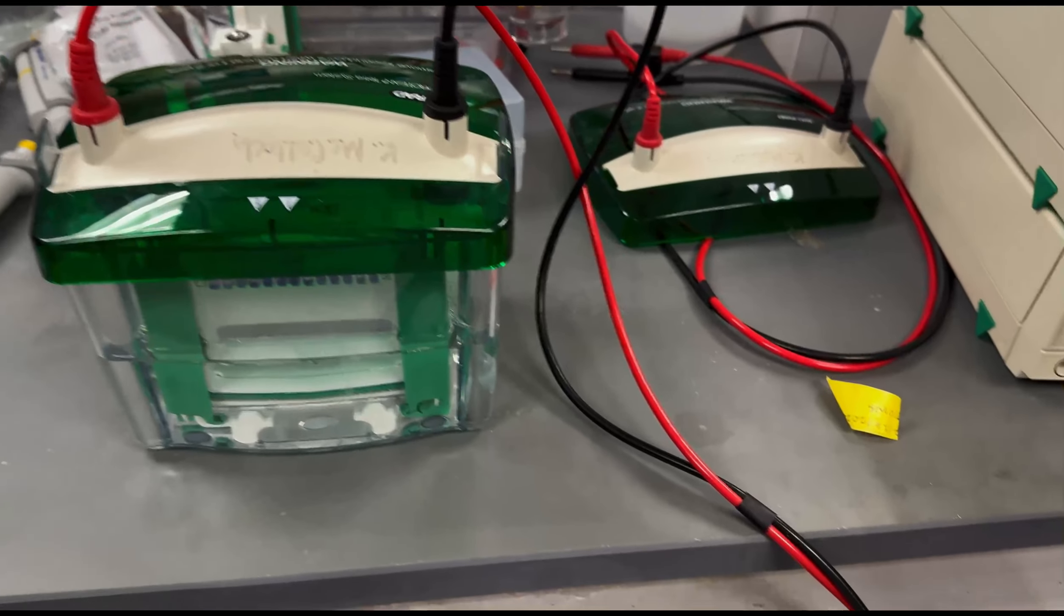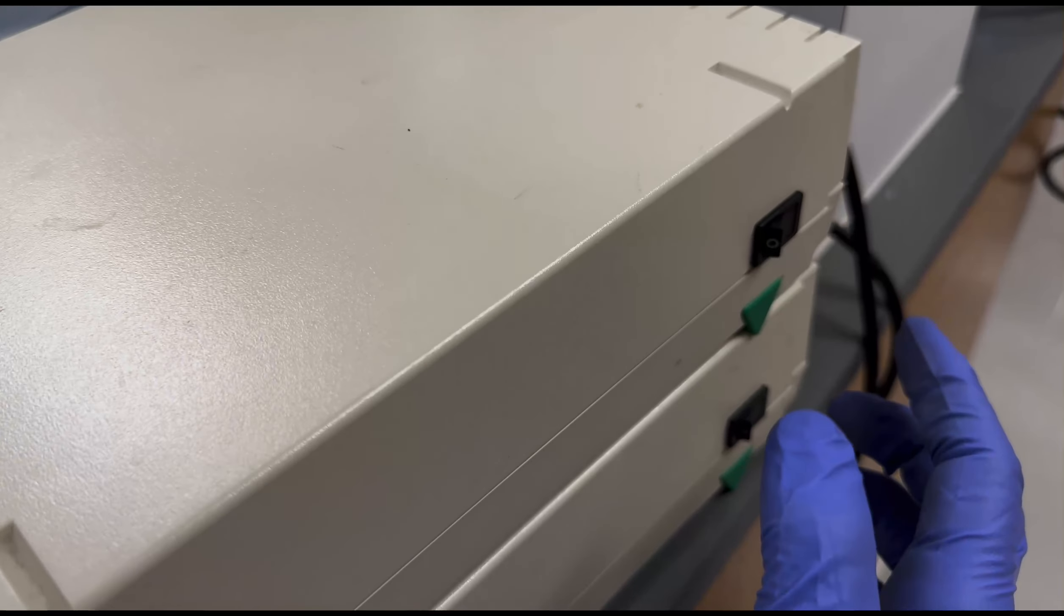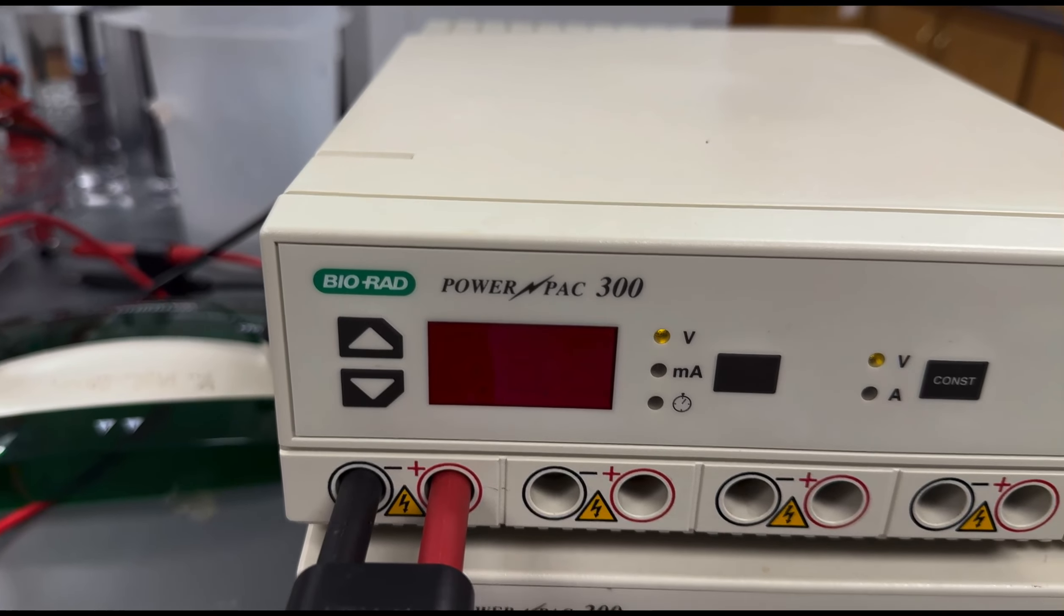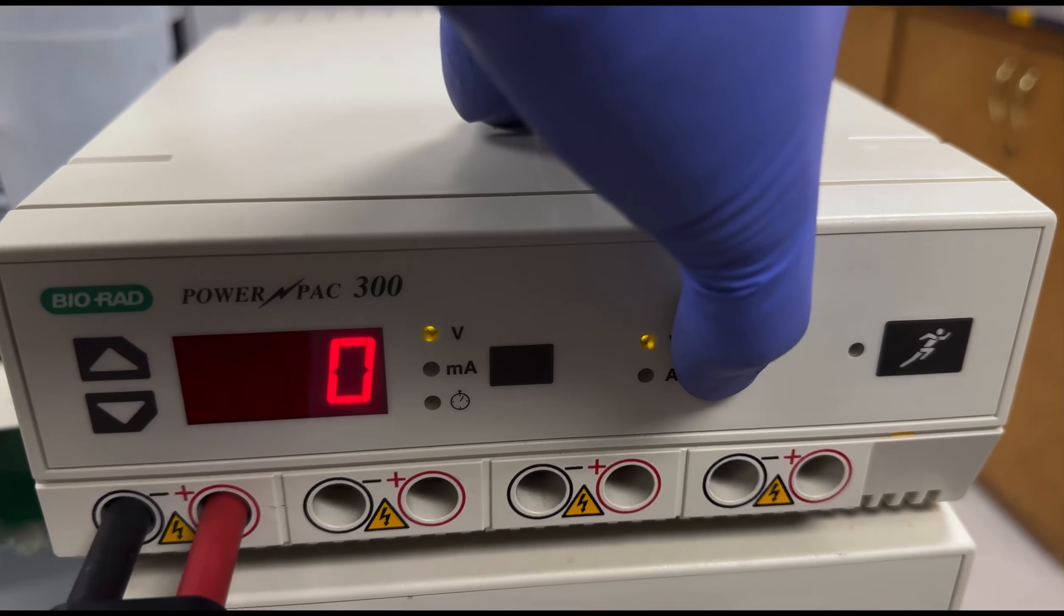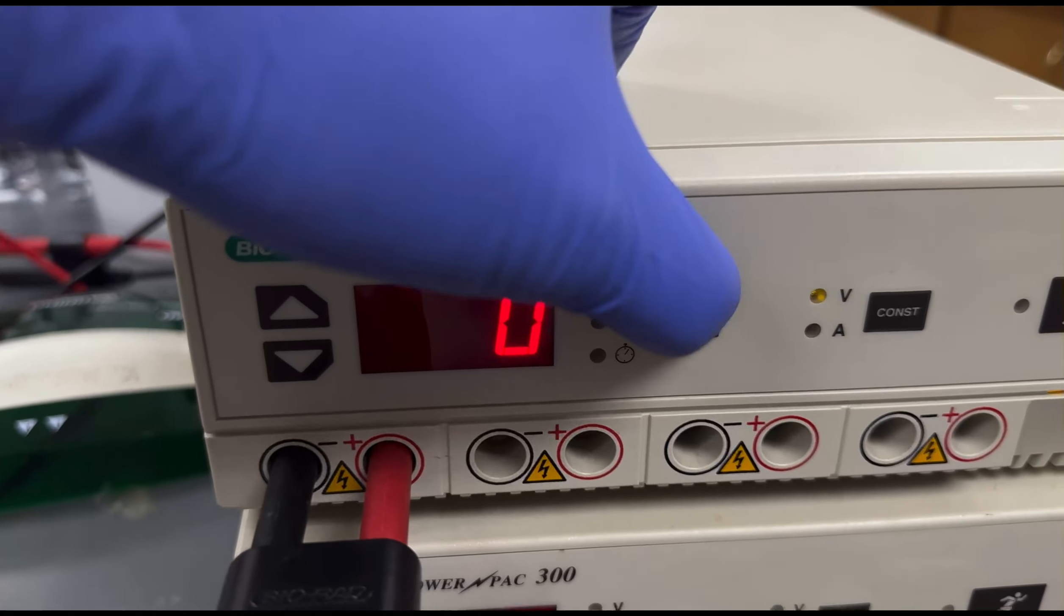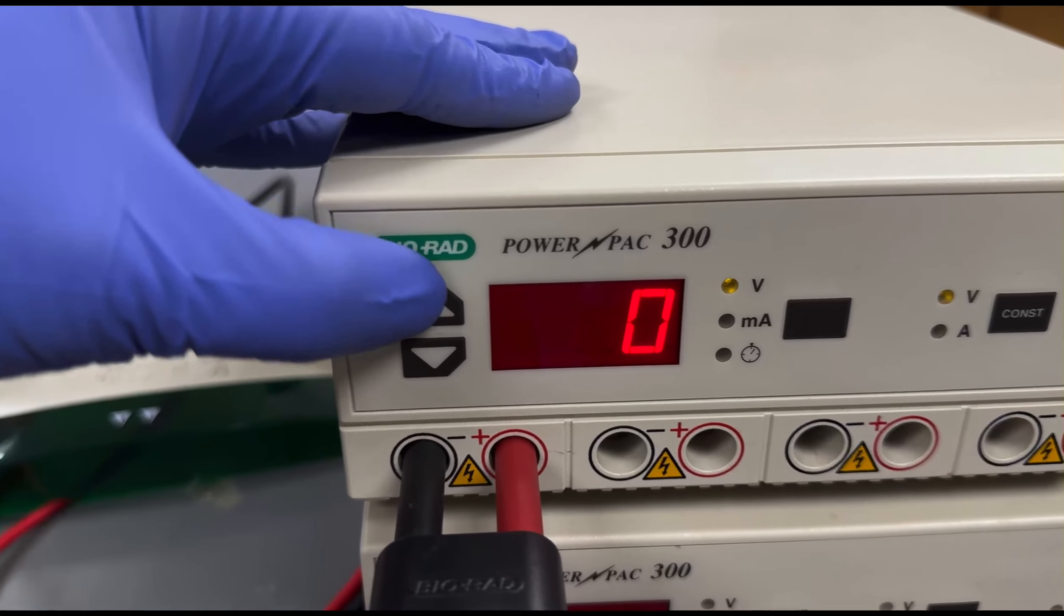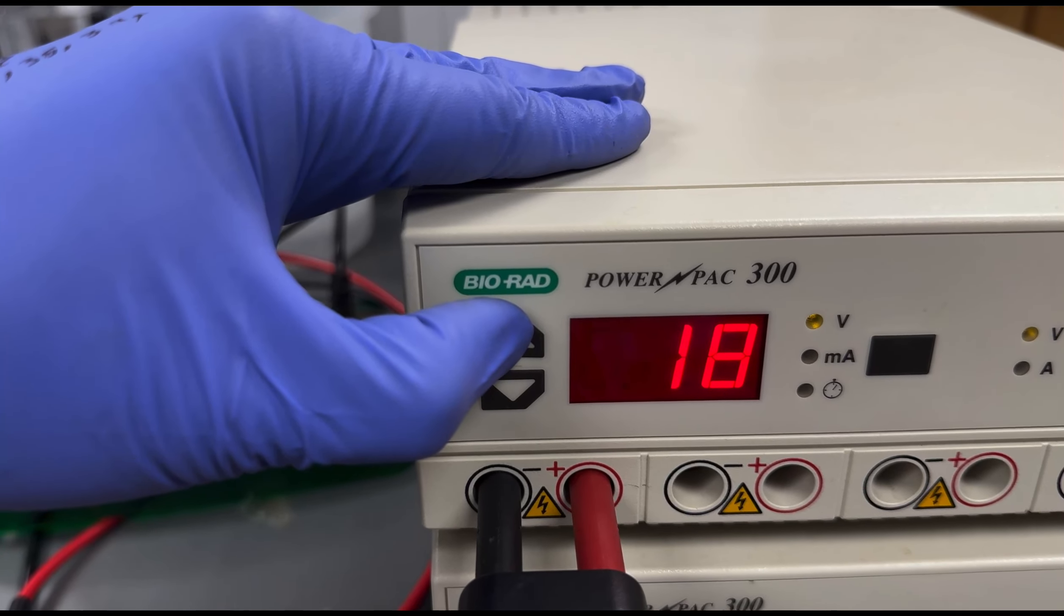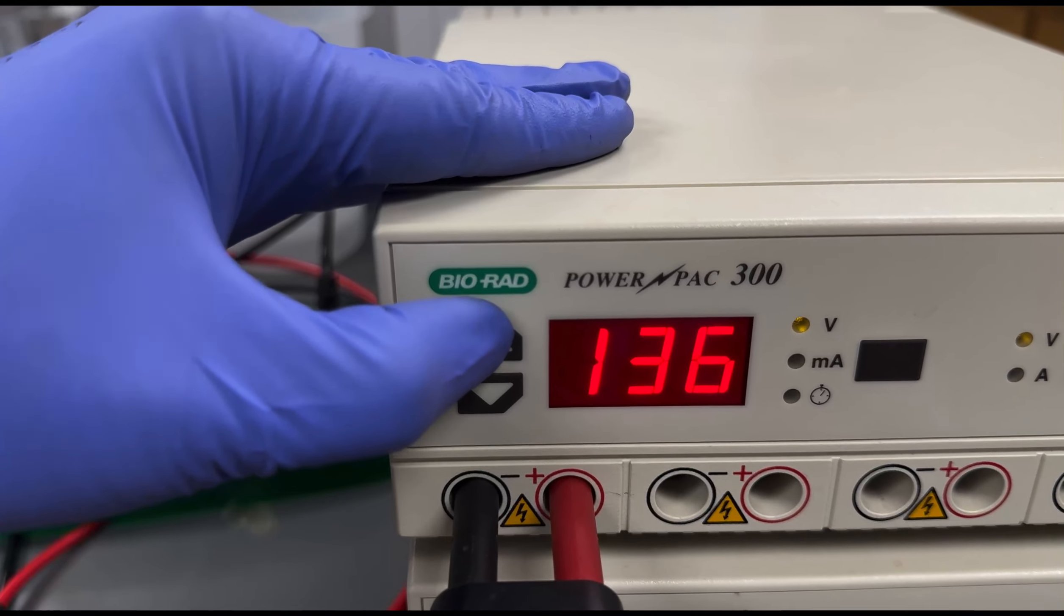Once complete, the lid containing the electrode ends is placed onto the cell, ensuring that the positive and negative current ends match. The power supply is set to a voltage of 180 volts and allowed to run for approximately 45 to 60 minutes or until the molecular weight standard reaches the bottom of the gel.